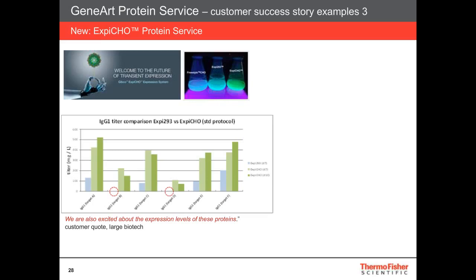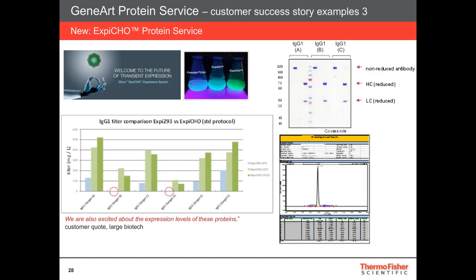And also the quality of those purified antibodies was very good, as I want to indicate here on the right side of the slide, since even after affinity chromatography, monomer levels of those expressed antibodies were almost above 95%. So meaning that no additional polishing steps were requested or required in order to deliver high-quality antibody protein. And of course, those systems are not restricted to antibody production, since they work as well for example for Fab or other secreted epitope-tagged non-antibody targets.